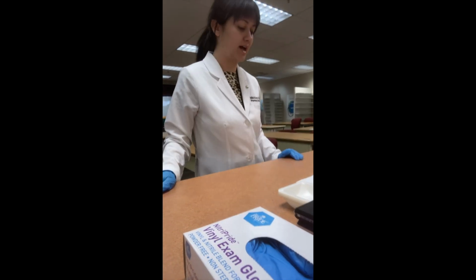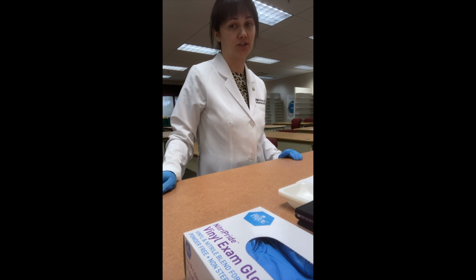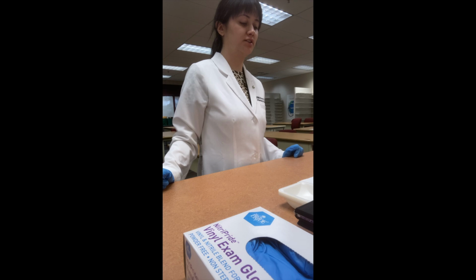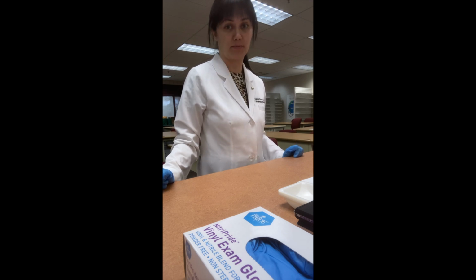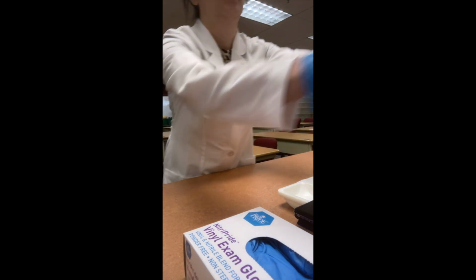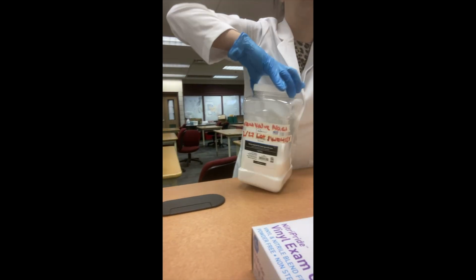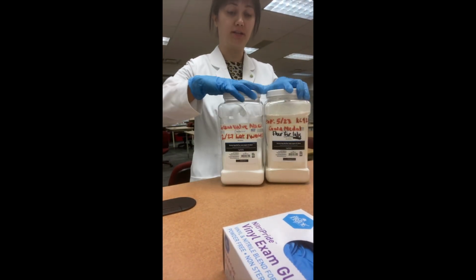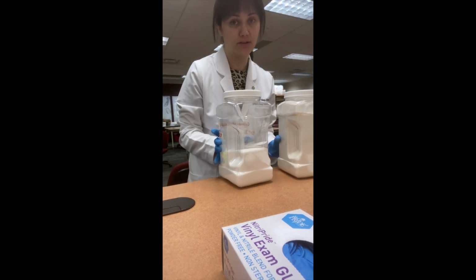The first step in this lab is to verify information before you start compounding, verifying information of the ingredients that you're going to use. Here, our first ingredients that we need to mix up in our paint lab are flour and salt. For the flour and salt, I put little labels on here. You just have to verify information.